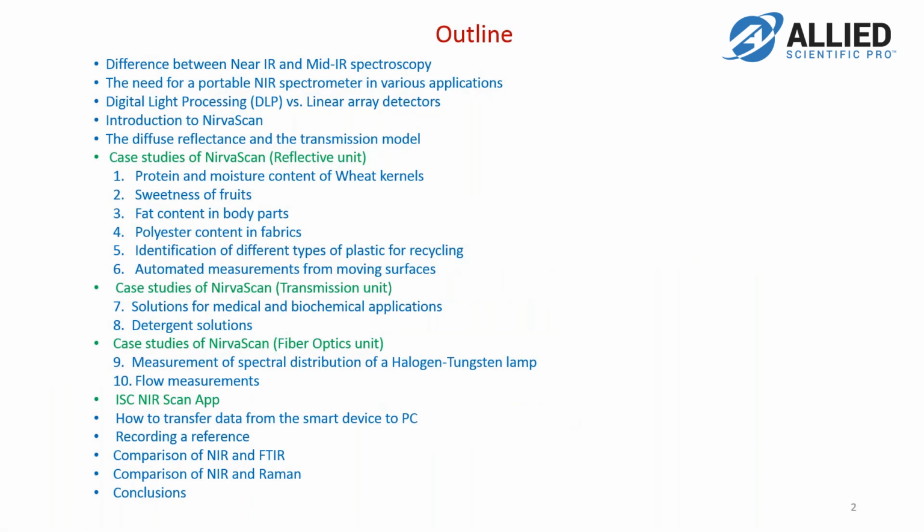This webinar, I've organized it in such a way that it will be a combination of basic theory, instrument features for different models, software, different applications, apps, and comparing the Near IR with other methods. So I'll go through the difference between Near IR and mid IR, and the need for a portable NIR spectrometer in various applications.